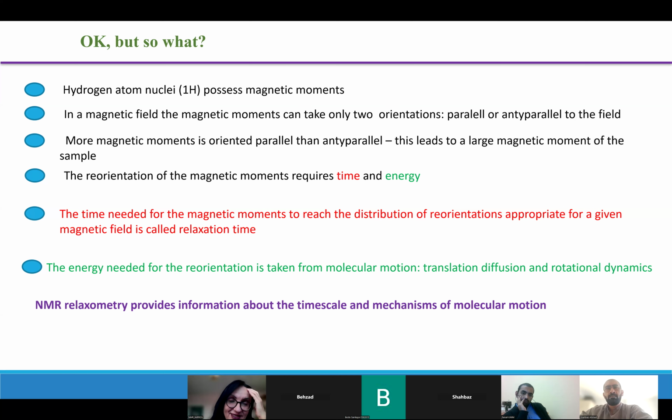One can always, and maybe not always, but in many cases, one applies something called isotope substitution. For instance, it attaches some paramagnetic molecules, or, coming back to the isotope substitution, replaces, for instance, one H by 2D or something like that, and then there are methods to follow them. But putting this aside, let's imagine that by miracle I can label them.